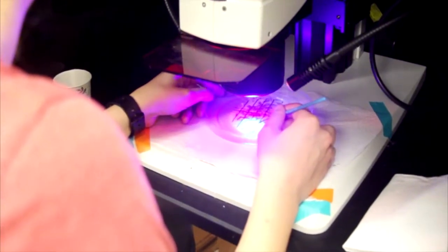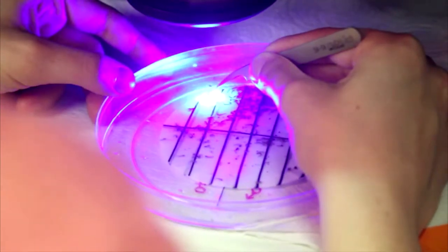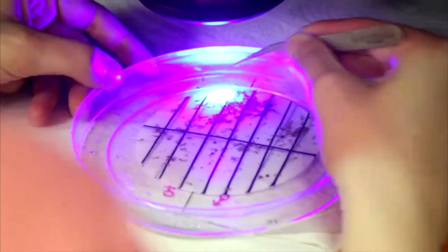Place the filter paper on a petri dish and screen for fluorescence. Remove any negative larva using forceps. Once screening is finished, the larva can be returned to the pan with fresh water and food.